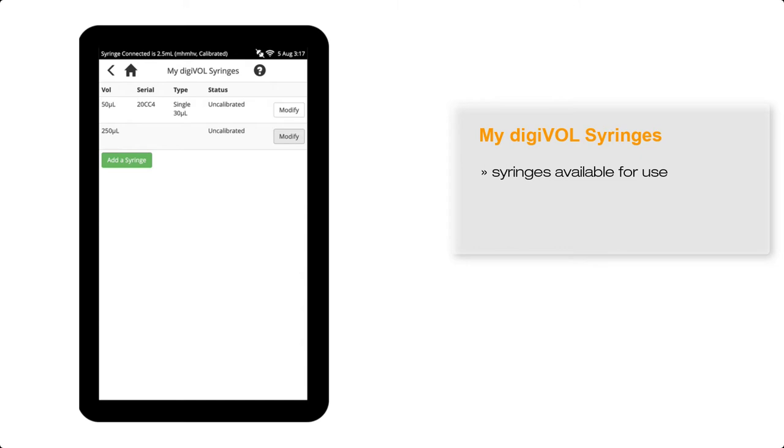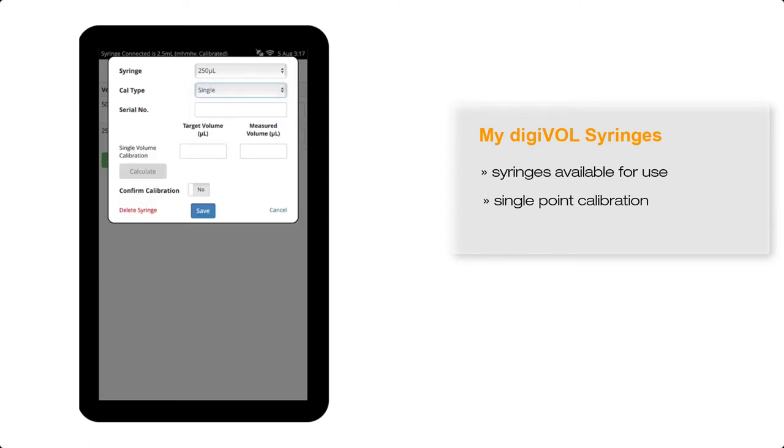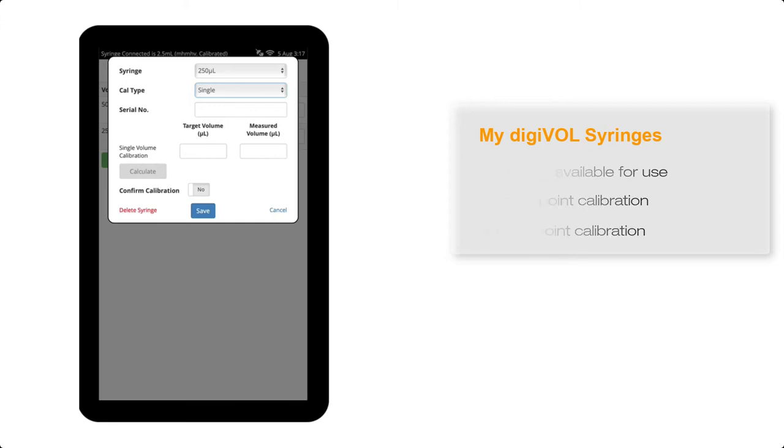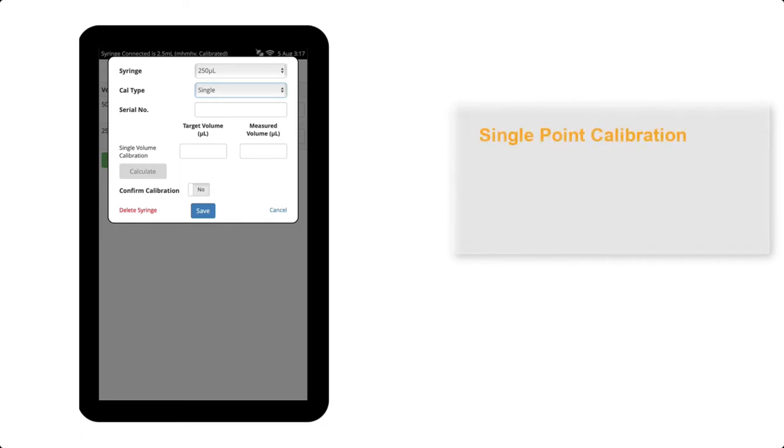To calibrate the syringe now, I'll select Modify, and then in the Calibration Type drop-down list, I'll select Single. We'll discuss the multipoint calibration shortly. Single point calibration is ideal for an application where you are always dispensing the same volume from this syringe.